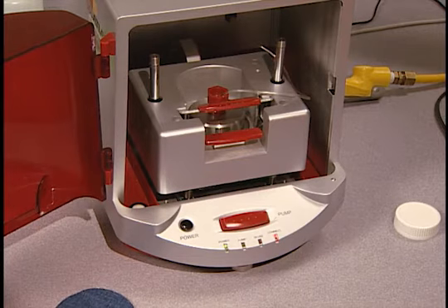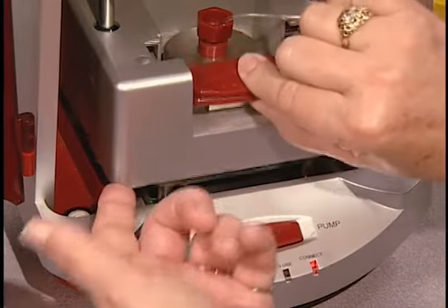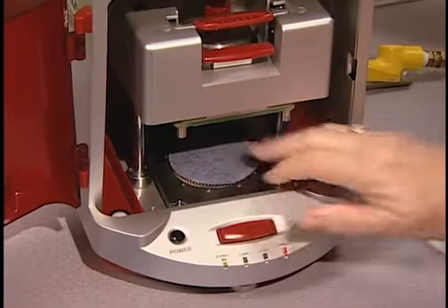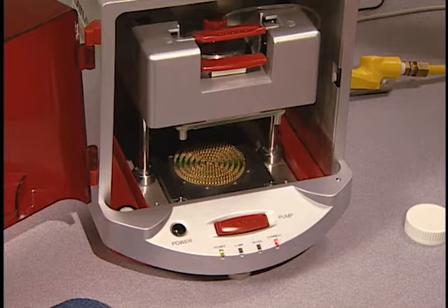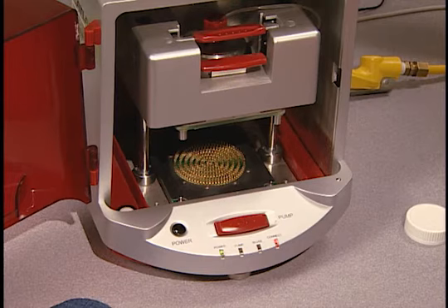The liquid is then free to move through the specimen's thickness and across the back and face, or what would be the outside of the fabric in a garment. Such moisture movement simulates what happens when a garment lies against sweating skin, the backside of the fabric. The fabric absorbs the perspiration and moves the liquid to the outside of the garment, the face of the fabric, where the moisture can evaporate, causing a cooling effect.